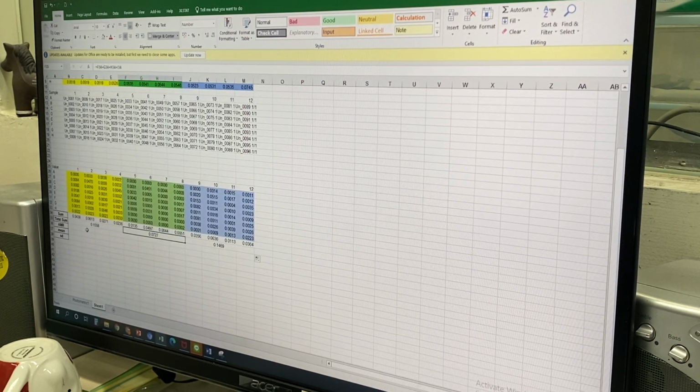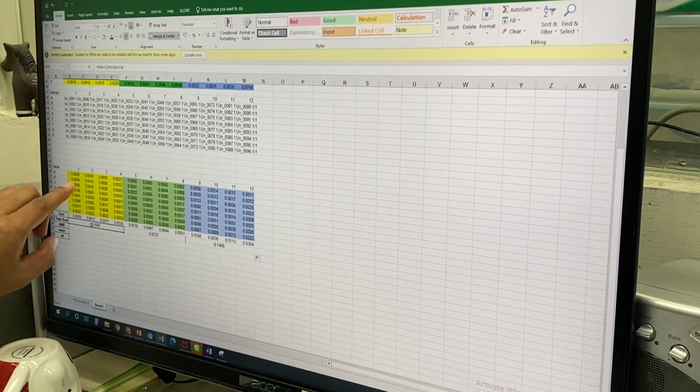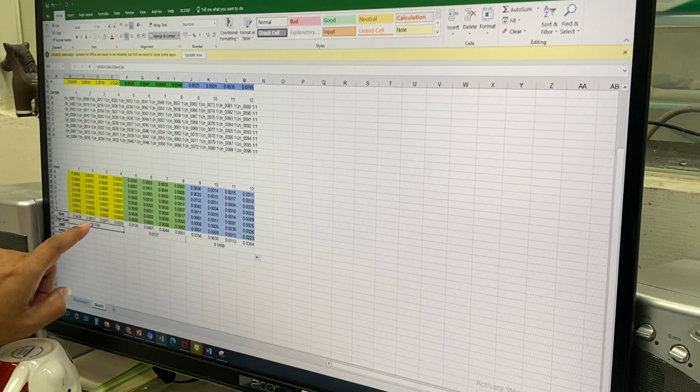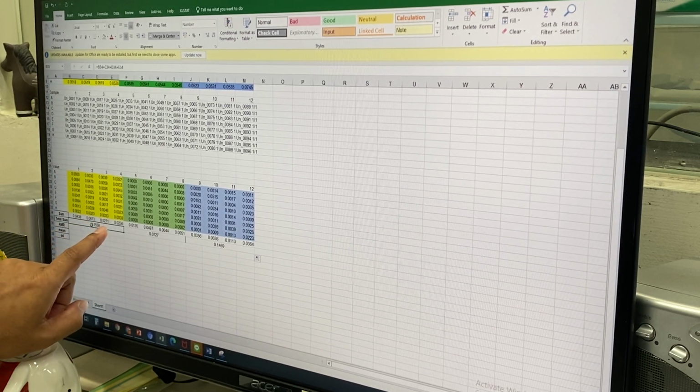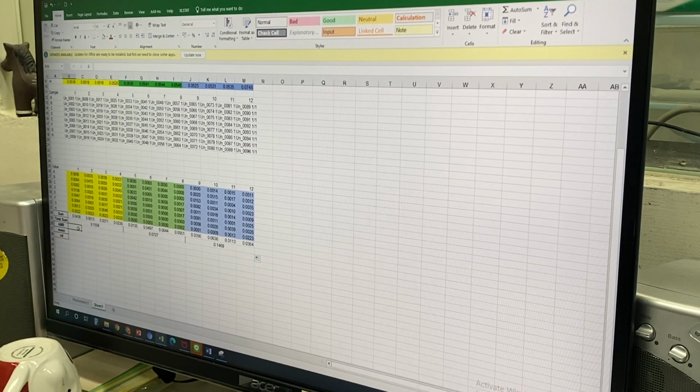And you have to do the average metabolic rate, right? Average metabolic rate, so this is your total metabolic rate. From this total reading, this is your total value. And how many wells do you have? 32 wells, right?